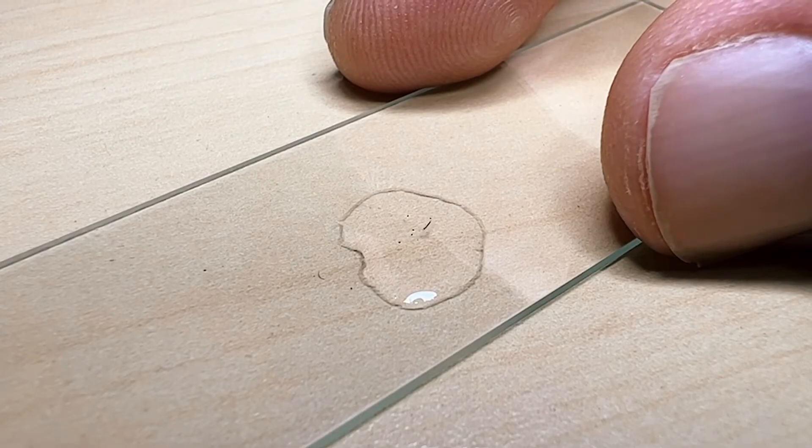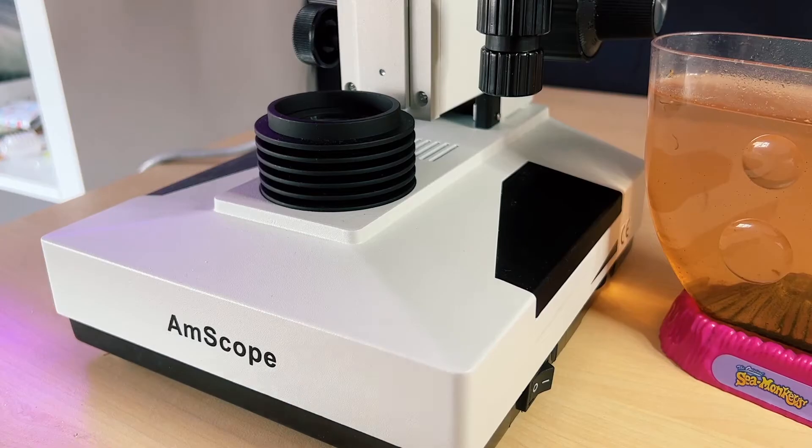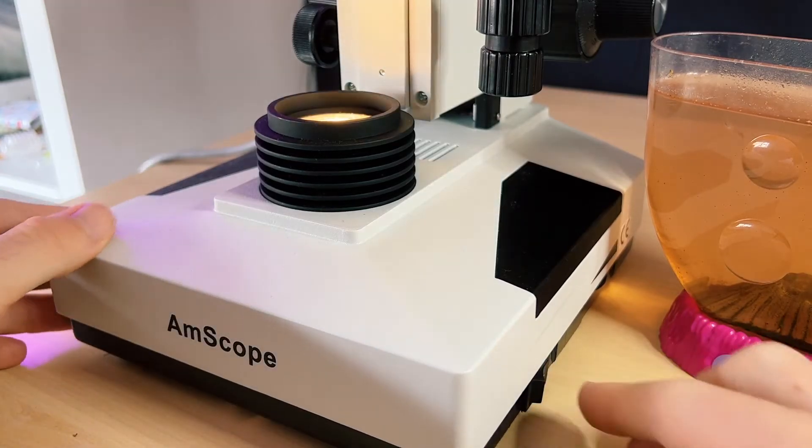We'll start off by looking at the smallest baby and then go gradually larger from there. The bodies of sea monkeys change a lot in their first few weeks of life so you'll see quite drastic development in their morphology as they grow.